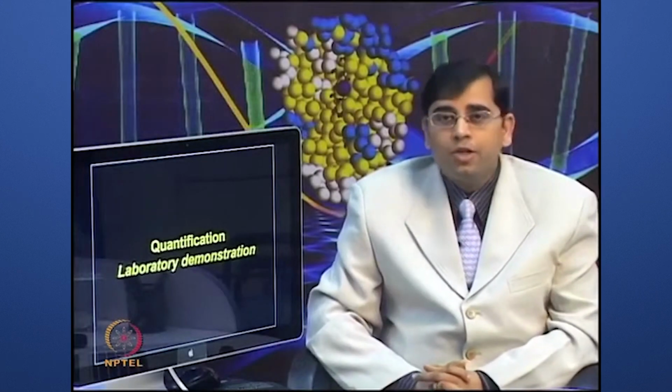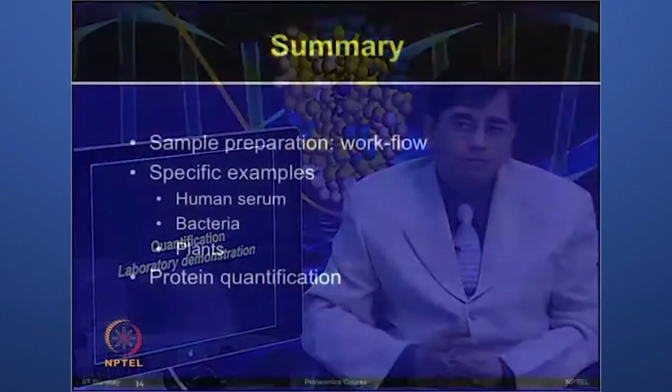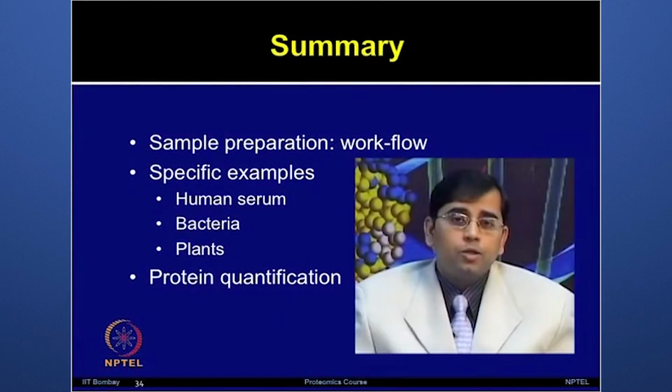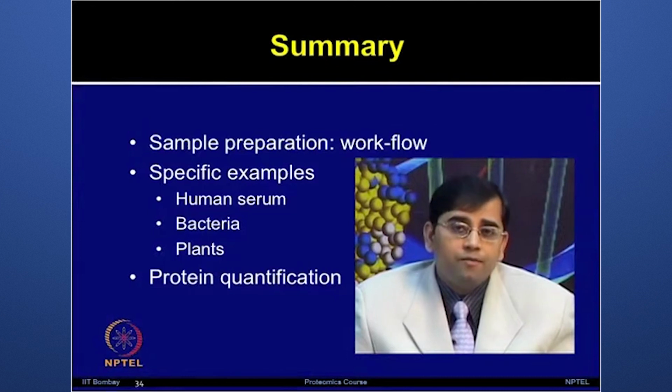Okay, so I hope it was useful for you to watch the video for protein quantification, and you got a feel for how to perform this experiment in the laboratory. So, in summary, in the last 3 lectures, we talked about strategies for sample preparation.